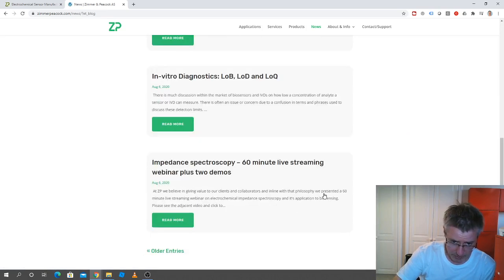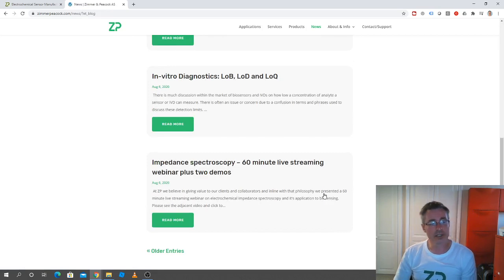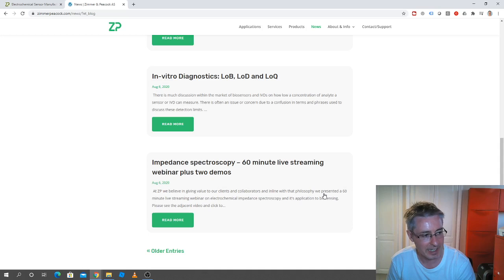Something else that we talked about this week: we did a 60-minute live streaming event for the community on impedance spectroscopy on Thursday. EIS, electrochemical impedance spectroscopy, is a powerful piece of technology, and we used COVID-19 as an example of what you can use EIS for.